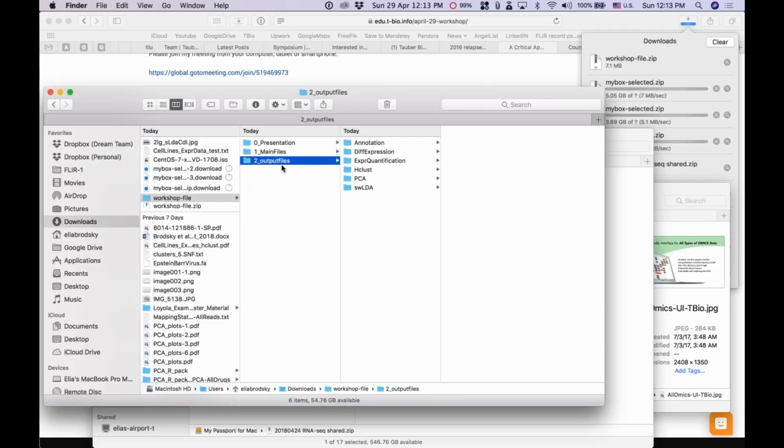If you want to play around with the platform and you have the credentials to access the platforms, it's very simple. You use upload, and then you can use some of these files to just get started. Now, you also can download files from something like GEO, or if you have your own files. So if you have any questions about that, just let us know.